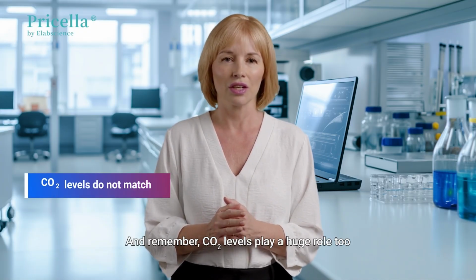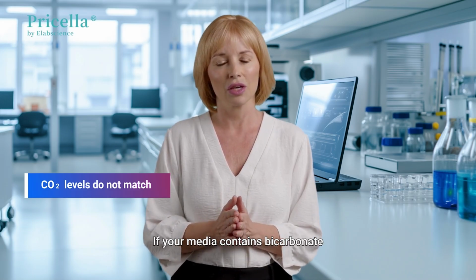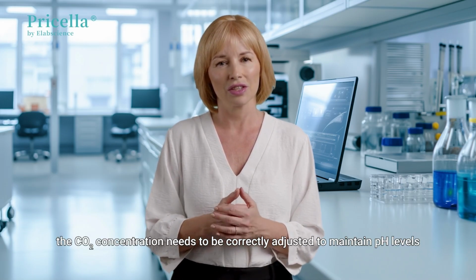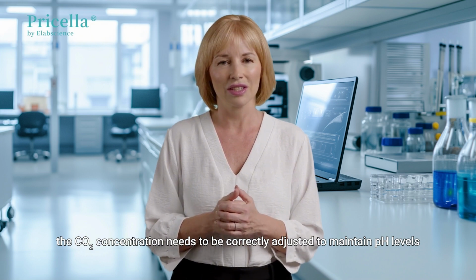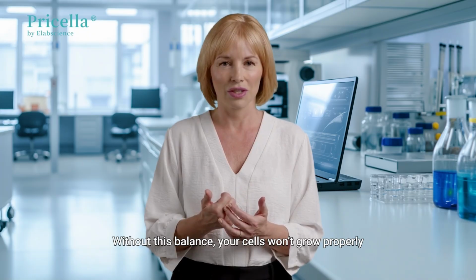And remember, carbon dioxide levels play a huge role too. If your media contains bicarbonate, the carbon dioxide concentration needs to be correctly adjusted to maintain pH levels. Without this balance, your cells won't grow properly.